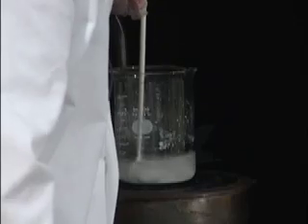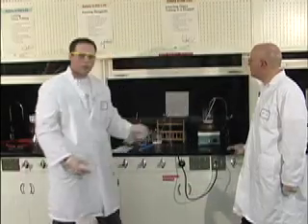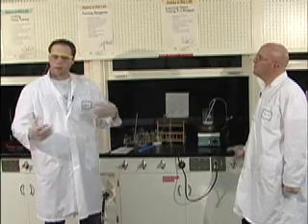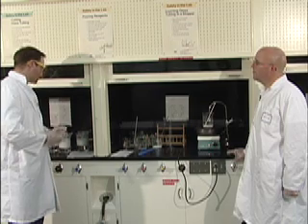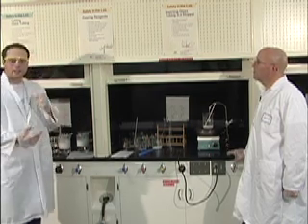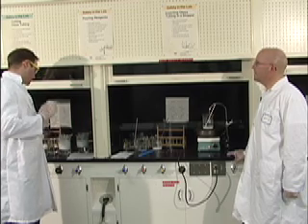And you'll notice when this is on the steam bath, right away the little chunks will dissolve and go right into solution. The big chunks are going to take forever to go into solution. So you want to make sure you have as many little chunks as possible. So break it down into powder. Breaking it into powder is the best way to do it.